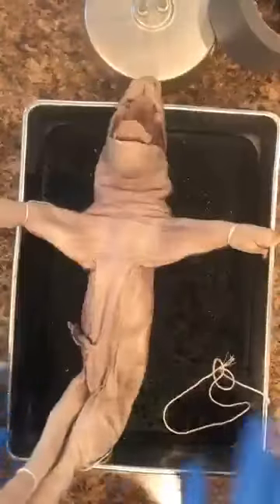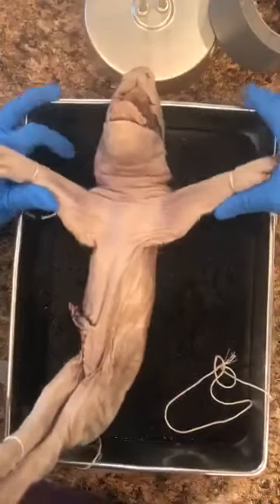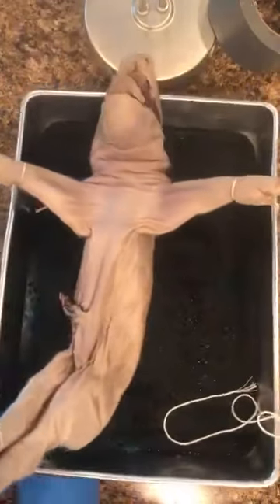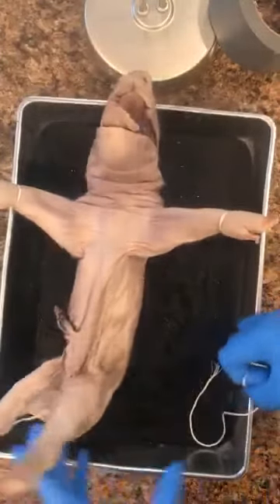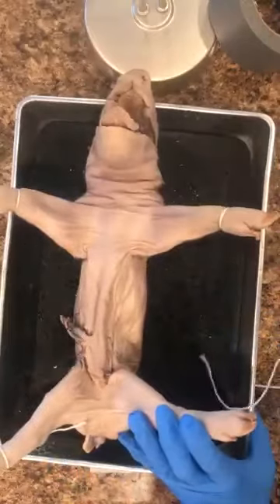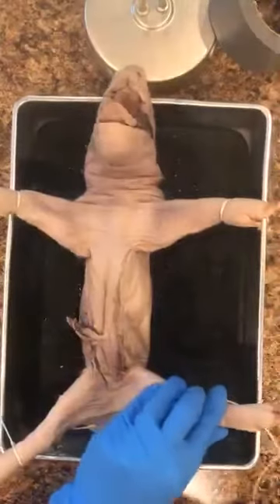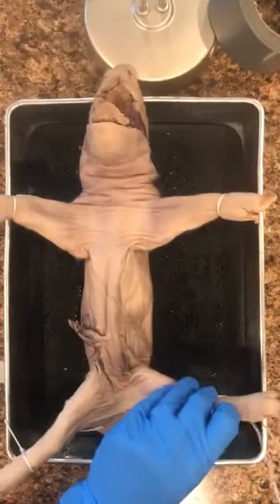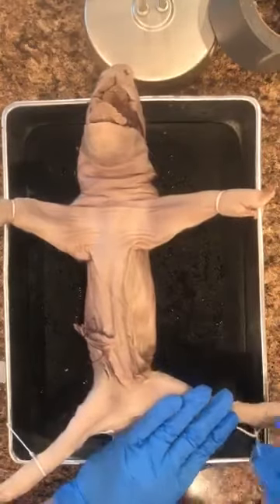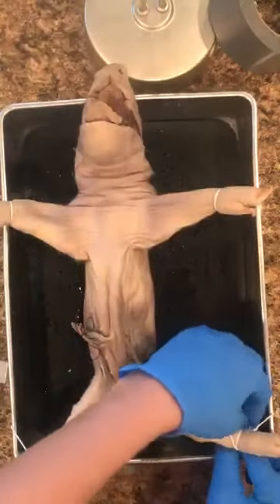Okay, I'm going to turn this pig around at this point so it's easier for me and scoot her up. So we can start with the digestive system. Okay, I have to rope off the pig so that it's easier for me to make cuts and to keep the body open. Okay. Do that one more time.